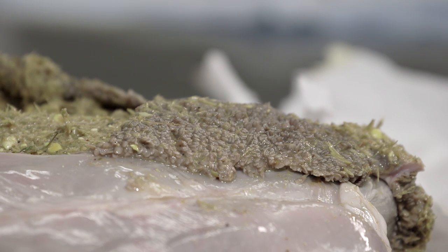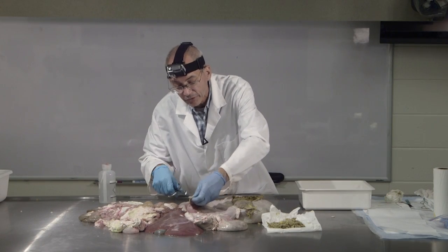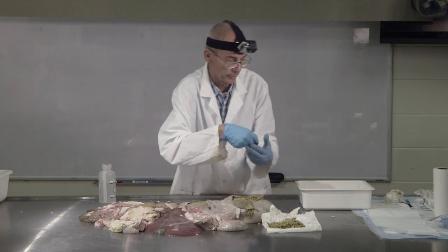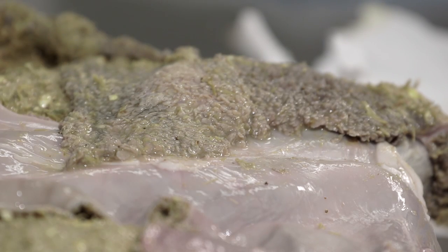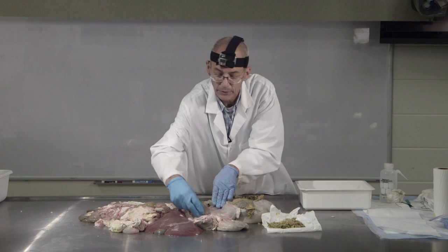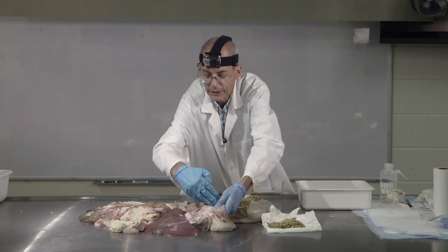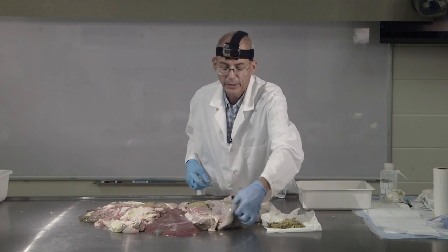Anywhere you go on the inside surface of the rumen, if we were to look up here, you'll see that same basic shag carpet kind of look to the material. I'm going to clean that off a little. Okay, and so this is the compartment where the food will reside for the longest. It may be in here for a day and a half or so, or even a little longer as far as digestion is concerned. So that's the rumen, and again, here's where the esophagus comes in, and the food material can either go in this direction or it can go to this second compartment, and that's the reticulum.